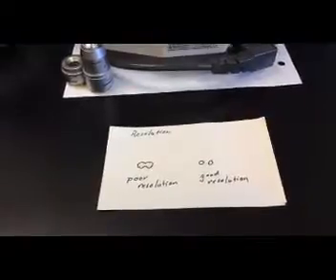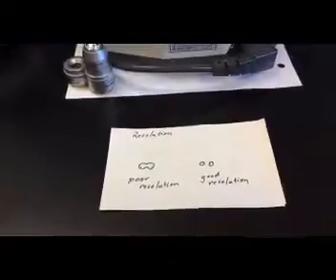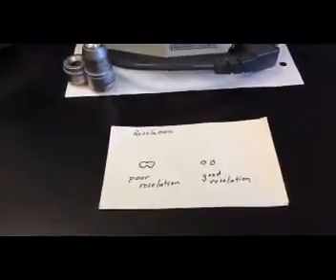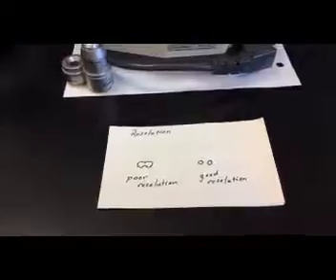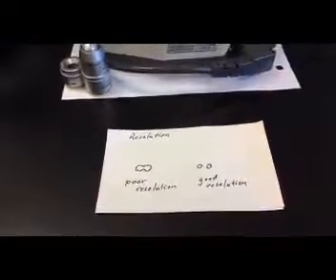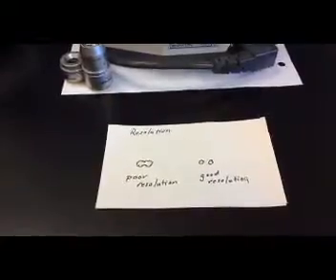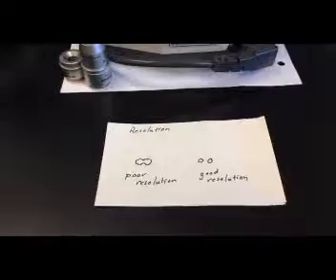And then on the right, we're looking at those two cells using a microscope that has good resolution, and we can see we have nice, clear, defined outlines of the cells. We can tell that, yes, indeed, these are two small cells that are really close together. So when working with our microscopes, we're interested not only in magnification but also resolution. So we'll go back here to our first card.